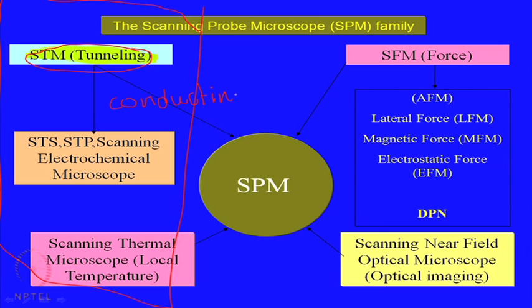Since we are talking primarily about polymers, we will not worry about them. Next comes the SFM, again a generic name, scanning force microscope, of which the most significant member, the major platform, is the atomic force microscope.